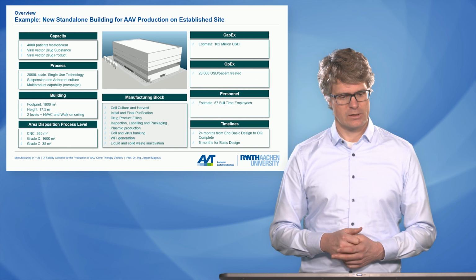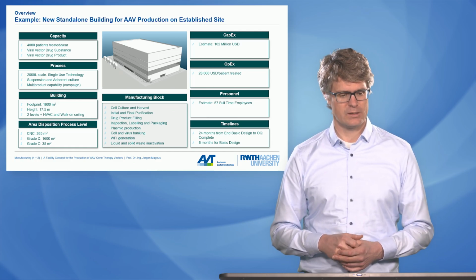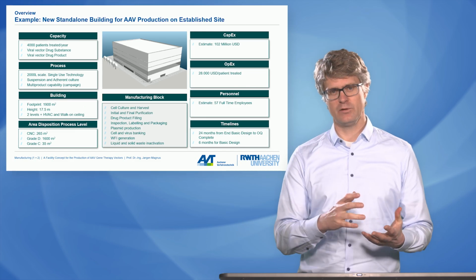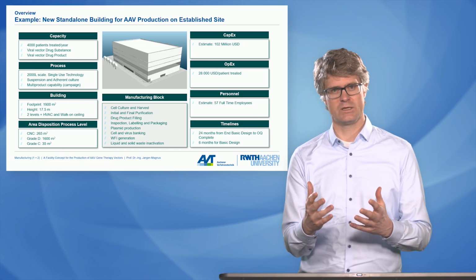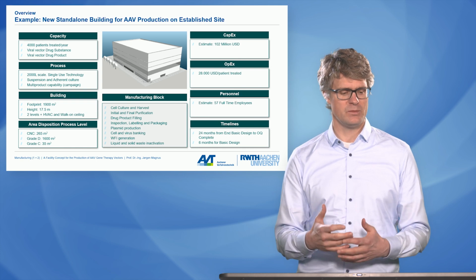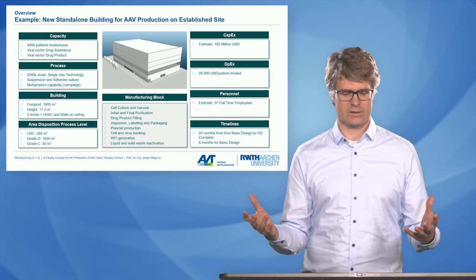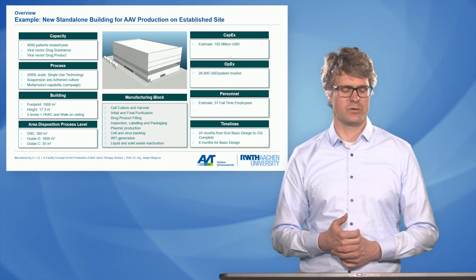So the first thing that you have to think about when you decide the facility is how big are your bioreactors going to be, and how many bioreactors are you going to have in the facility. Because once you know that, you can calculate everything else based on the size of your bioreactors. So the whole equipment for downstream processing depends on the size of the bioreactors, and then the buffer preparation and the media preparation, also the utilities, all of that is then related to the size of the core process. And around that, again, you would build the facility, the building that can house the production process.